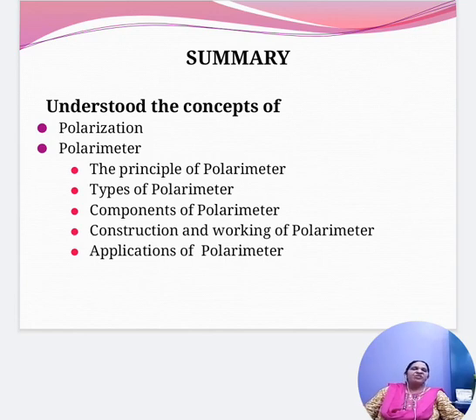If the tube is filled with an optically active substance, such as a solution of granulated sugar, a change becomes visible. The optically active substance has the following effect. The light at the back of the screen becomes much less visible. This happens because the oscillation plane of the light has been changed. The sugar solution, as an optically active substance, has rotated the polarization direction.